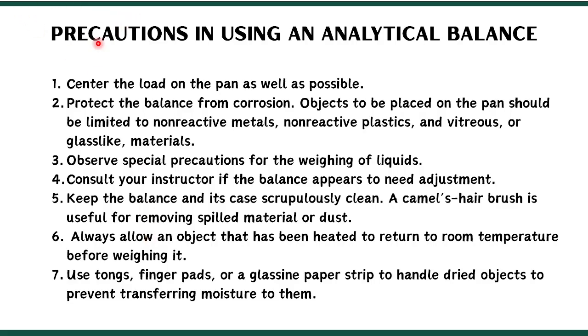Now, these are the precautions in using an analytical balance. So first, we need to center the load on the pan as much as possible. So kung magtimbang ta, dapat i-make sure na ang object nabutang na sa tunga sa balance pan.